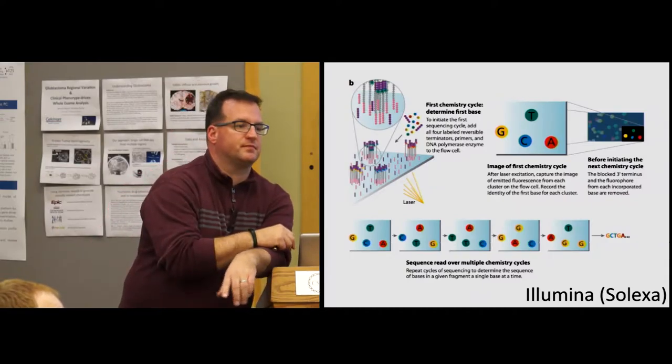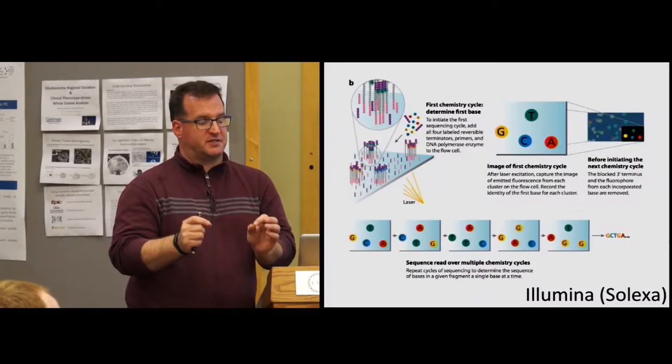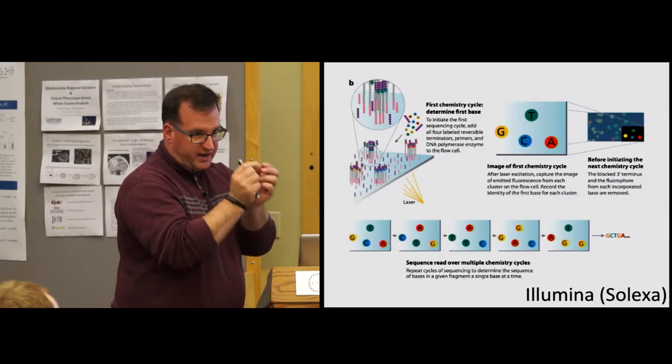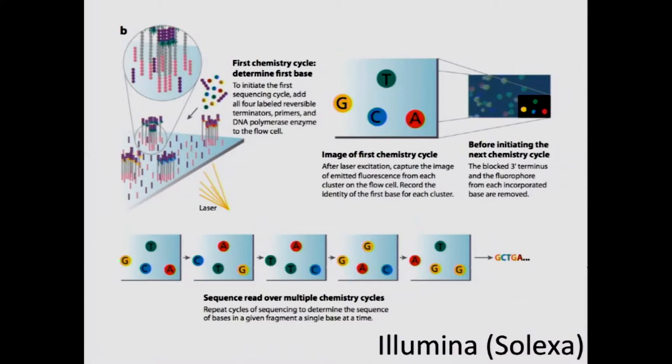Is there another question? I have a question regarding the size of the so-called spot. Does it reflect the number of reads or not? No. Any one spot is going to give you one read. This is a very small fraction of the overall glass slide. The glass slide is going to have hundreds of millions of spots on it, and every single one of those spots is going to turn into one read. So here, for example, here's one spot. Here's just a little tiny piece of the overall slide. It has four spots on it, four different colonies. And one of those colonies reads off G, C, T, G, A, and that is one read.